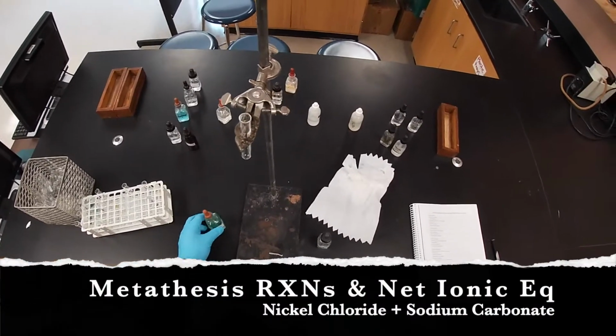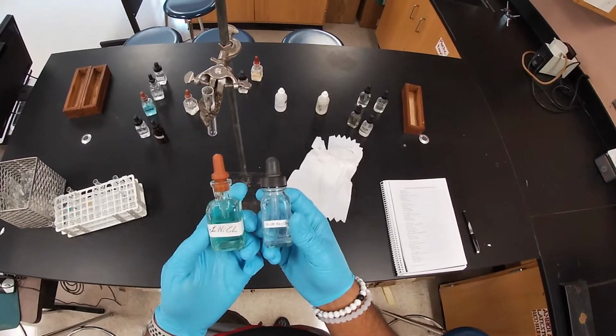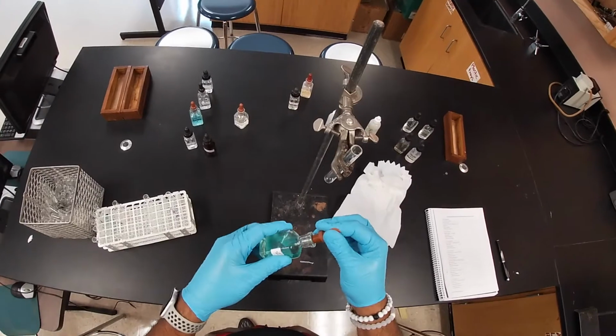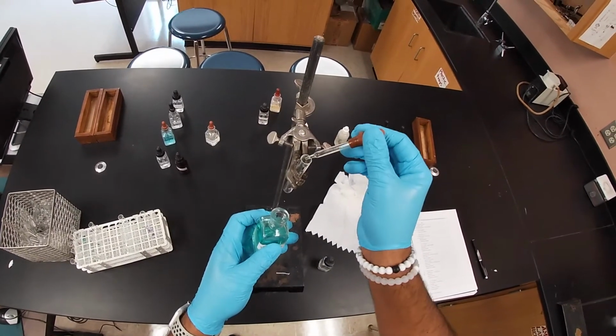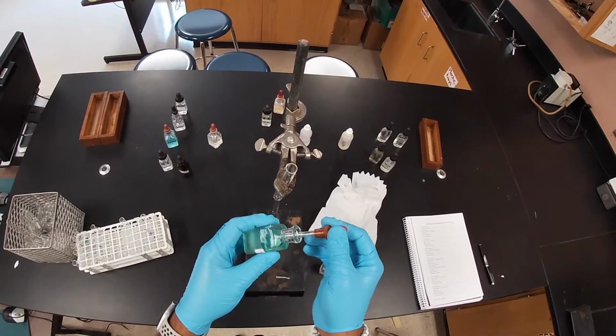Next reaction will take place between nickel chloride and sodium carbonate, reaction number 9. So we'll go ahead and do both here. Again, it's giving me a little difficulty. Oh, 1 drop, atta baby.